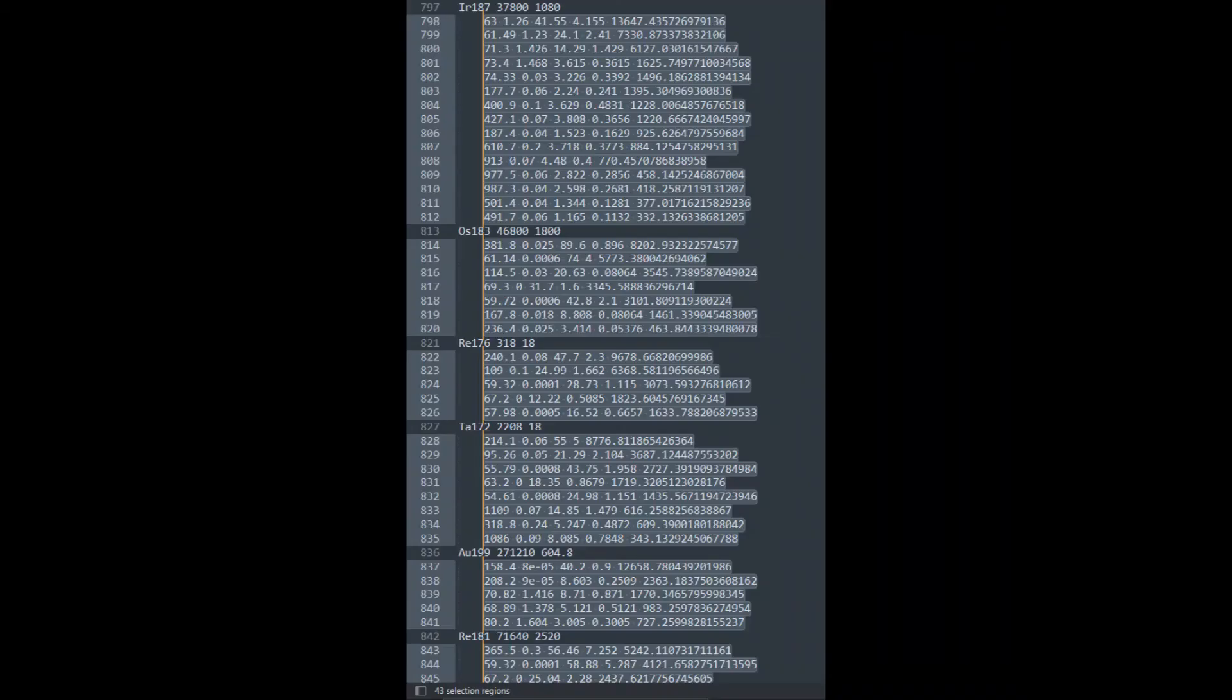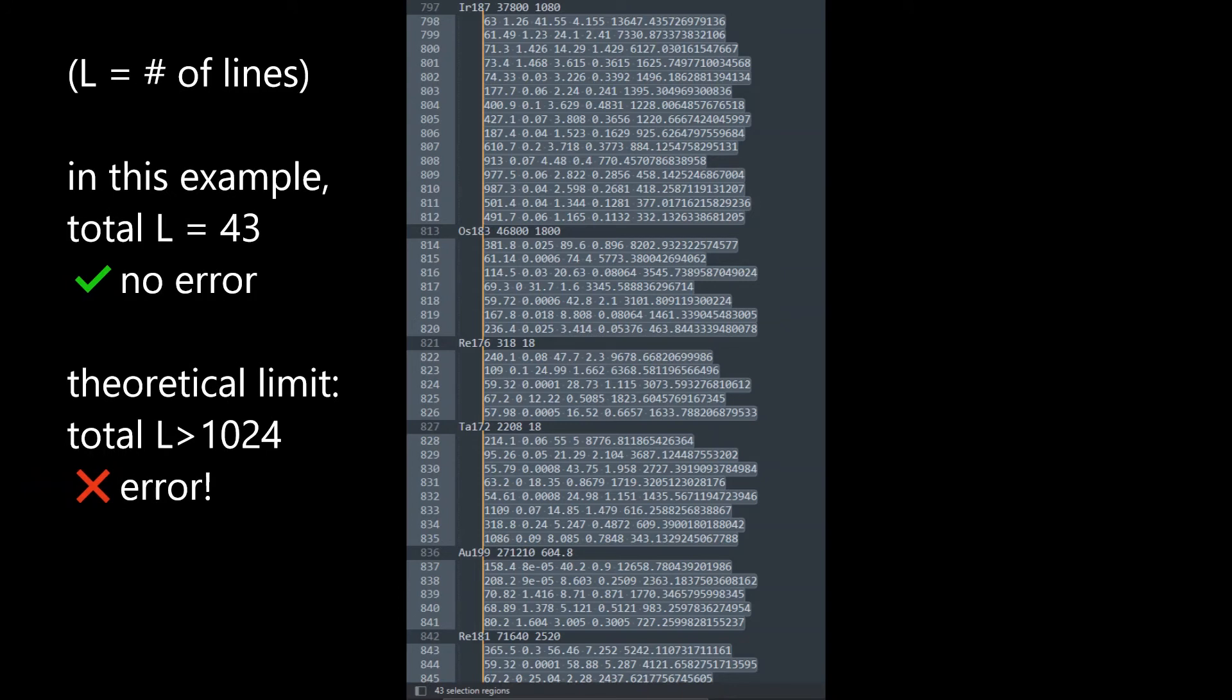For example, on the screen I have highlighted 43 lines. If all six of these nuclides were found to be present in this spectrum by Genie, then it will print out all 43 lines in the report.